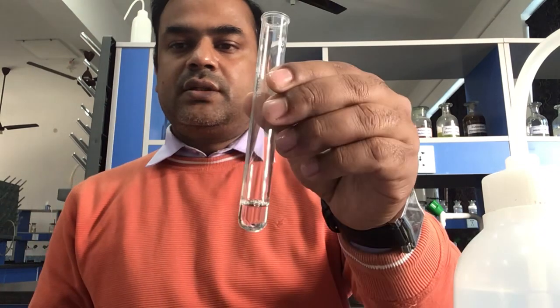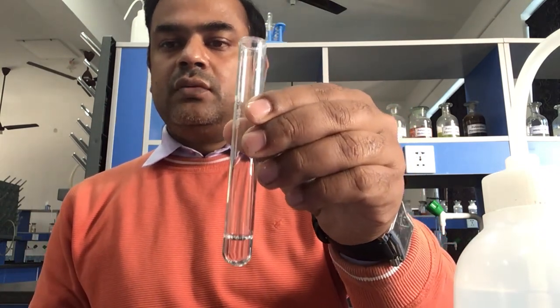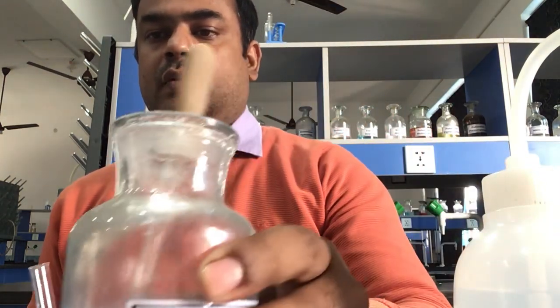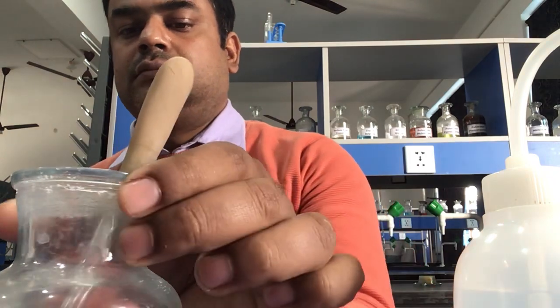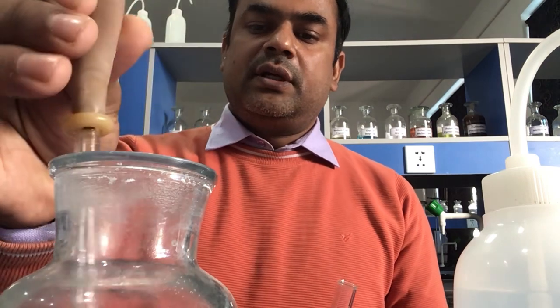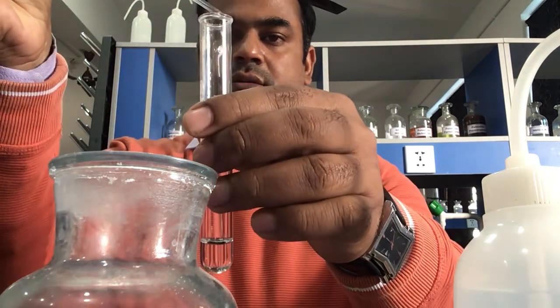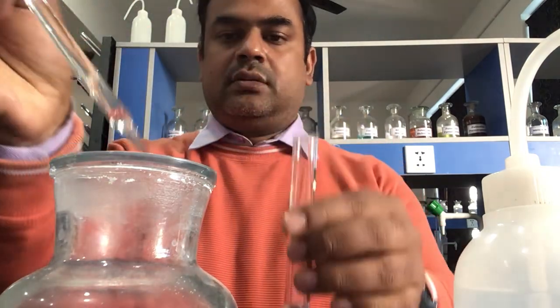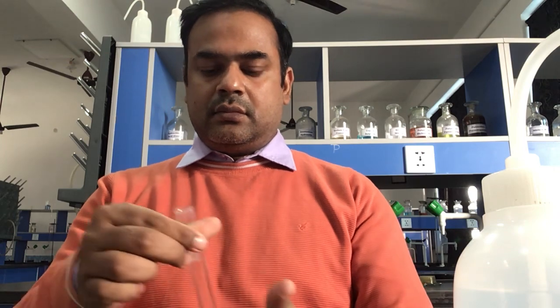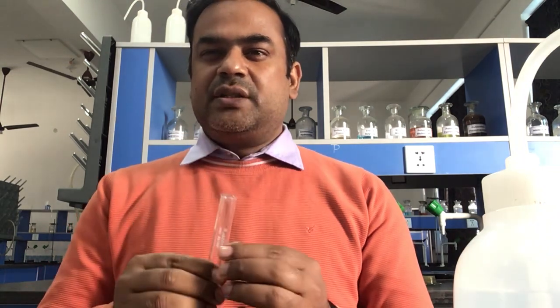The salt is completely dissolved. Now sodium hydroxide is added into it — you can see the sodium hydroxide being added. It is then dissolved, and a pungent smell comes out.